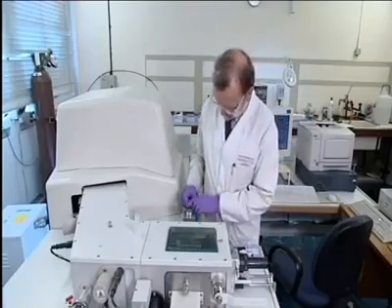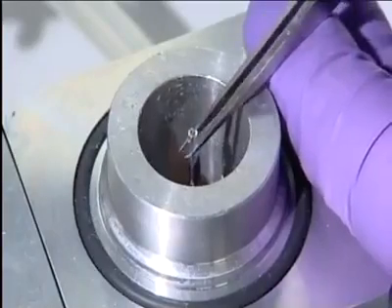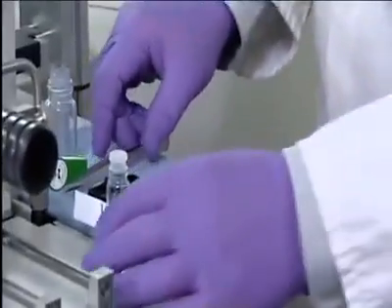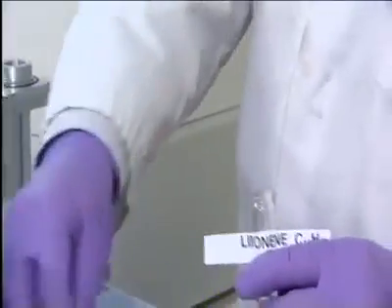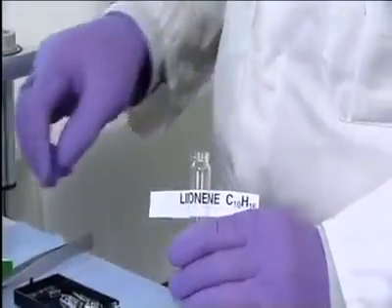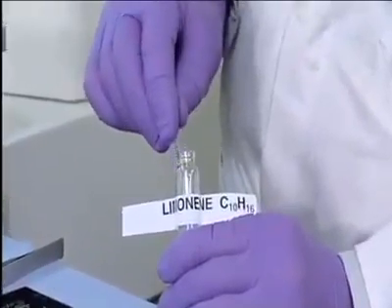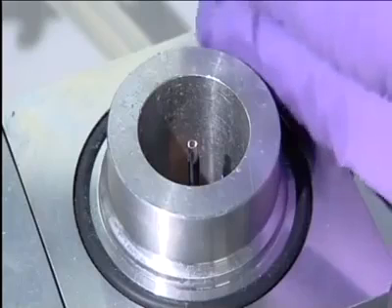Liquid samples are placed in the tiny sample tube as shown. Here we're running the mass spectrum of limonene, an alkene which can be obtained from the peel of citrus fruits. Only a little is required. Mass spectrometry can detect down to as few as 10 to the minus 12 moles.